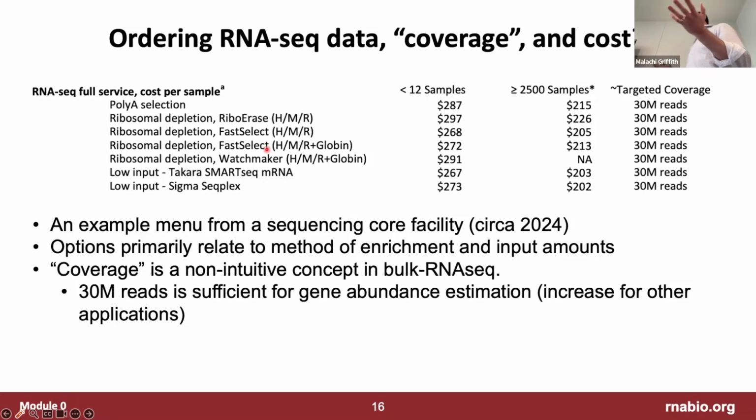And there was this really great paper that came out and said, you know what? You could sequence each sample deeper, but you'll generally speaking get a lot more value statistically out of doing more biological samples. Because biological noise is a real thing, and we're always skimping on biological variables because of cost. And then we get results and there are false positives, and we try to validate something and it doesn't validate. And it turned out it was just statistical noise or an artifact of our biological system because it was sunny one day and rainy the other day, or a different tech prepared the sample or whatever.